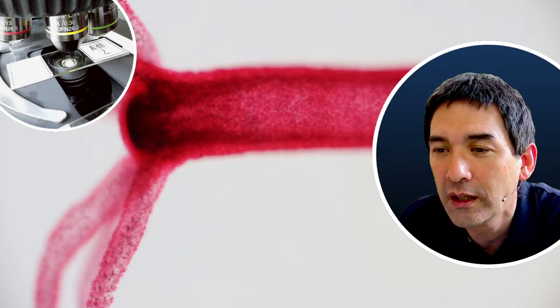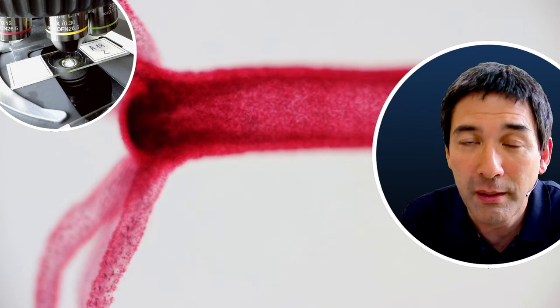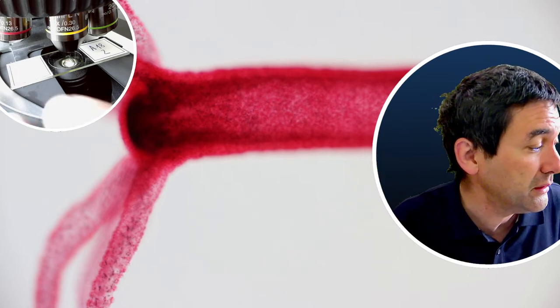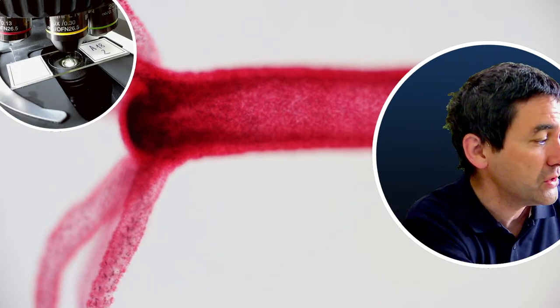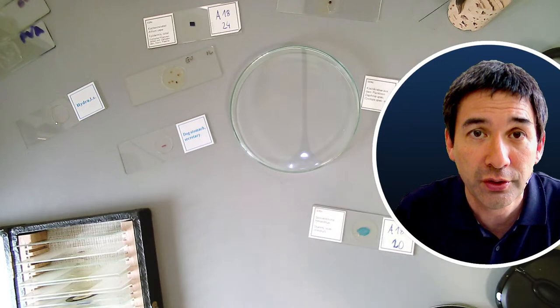I also have a commercial slide of Hydra, but the body was significantly shorter and tentacles were almost not visible. Hydra basically reproduces by budding — where a smaller Hydra grows out on the side. This depends very much on the individual slide and specimen. Not all Hydras look the same because we're talking about a natural specimen that changes over time, and no two slides of the same specimen look exactly the same.